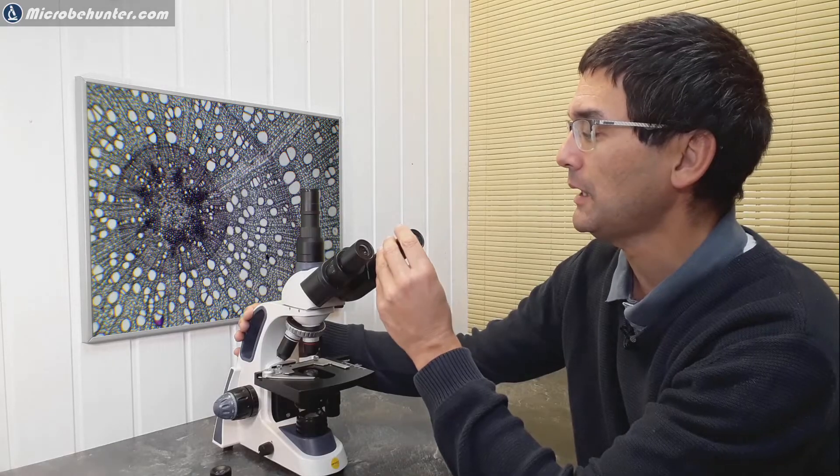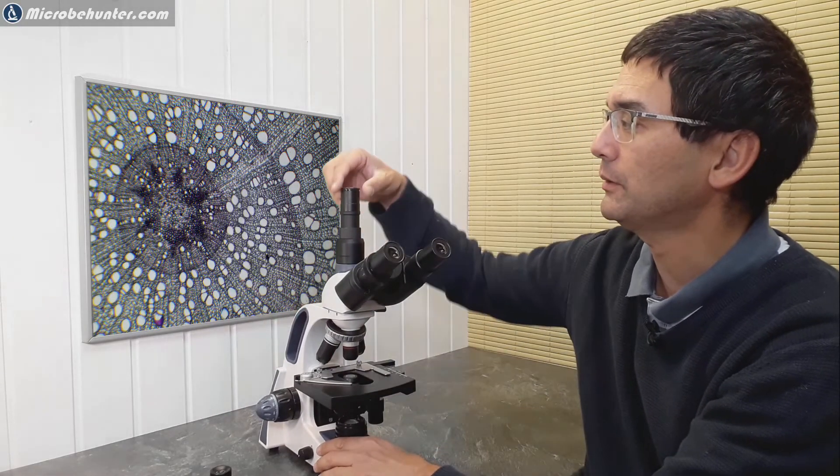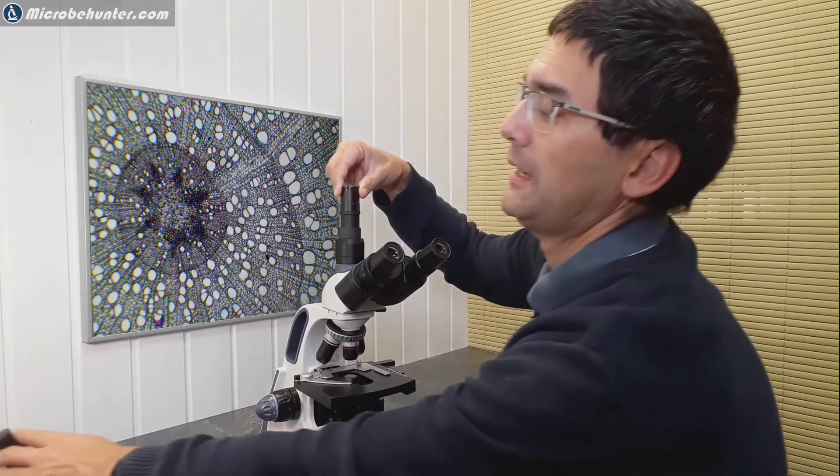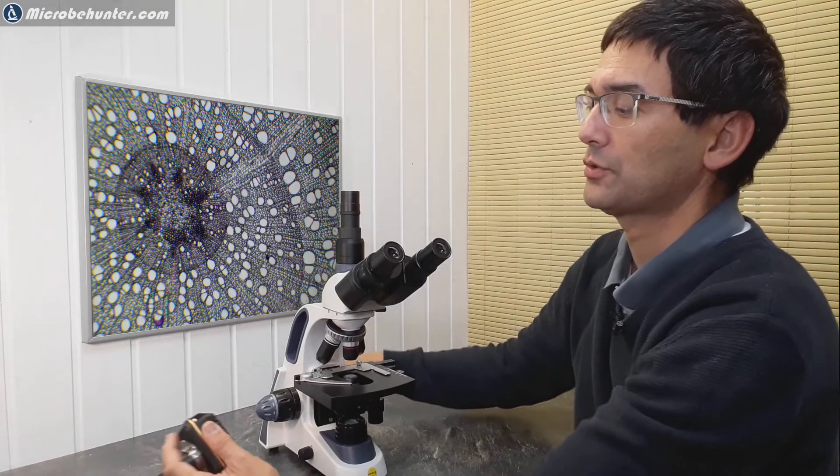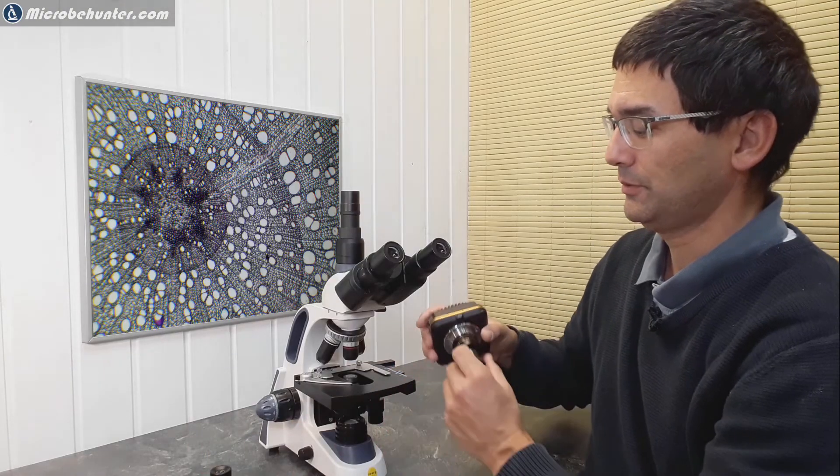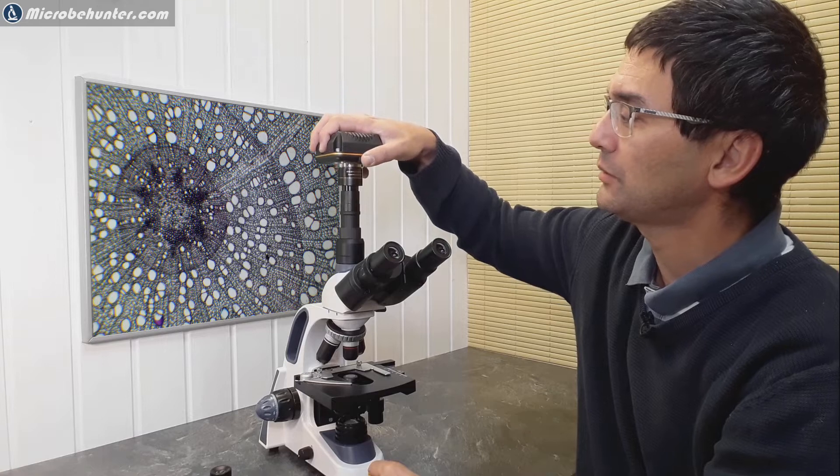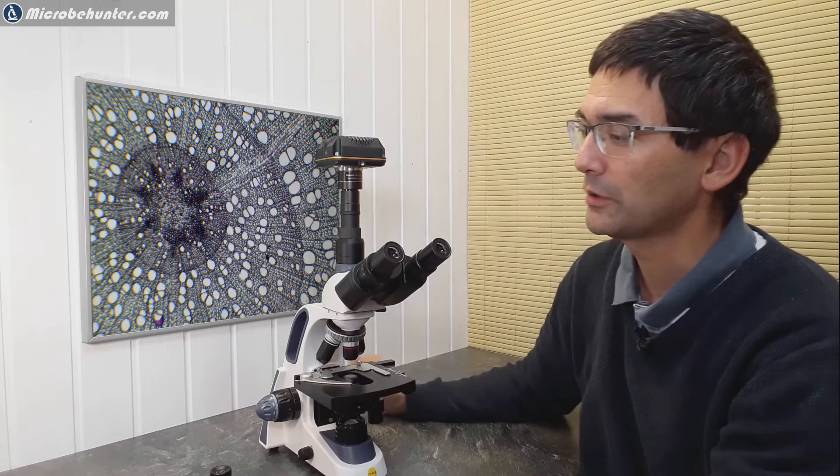Let me put the eyepieces back here again. Let's do the following - I'm just going to show you how I can connect the camera, so I'm going to remove the protective cap here. Over here I have a USB microscope camera. I'm going to remove the protective cap here, and of course you can directly connect it here to the trinocular head, nothing special here.